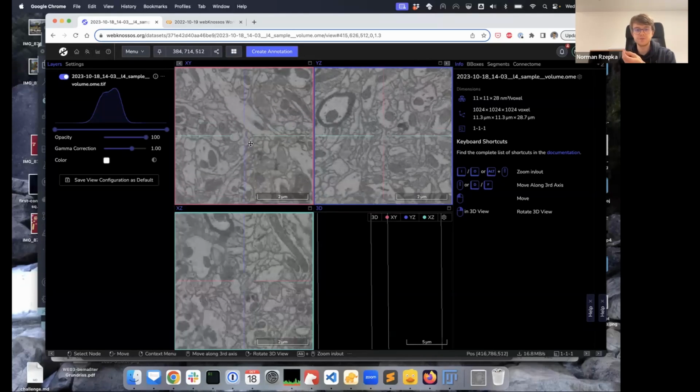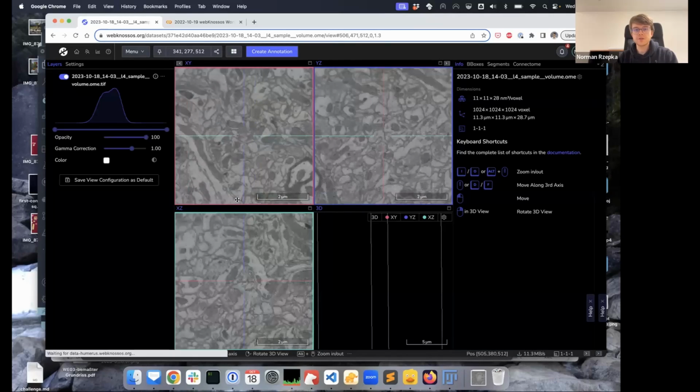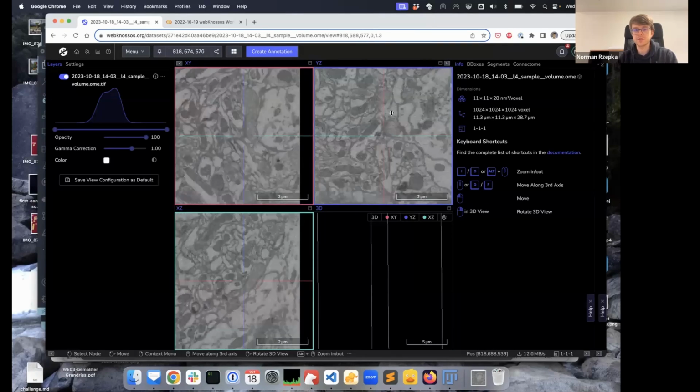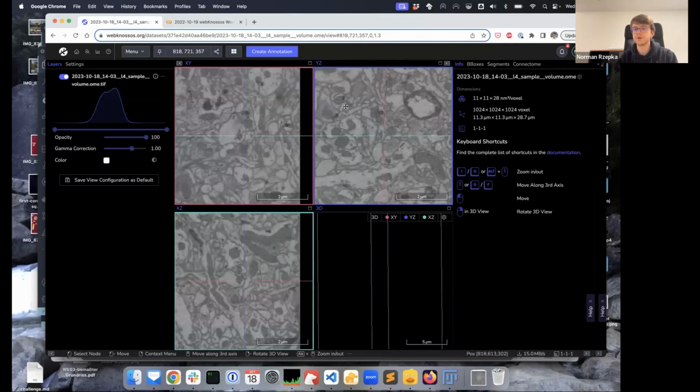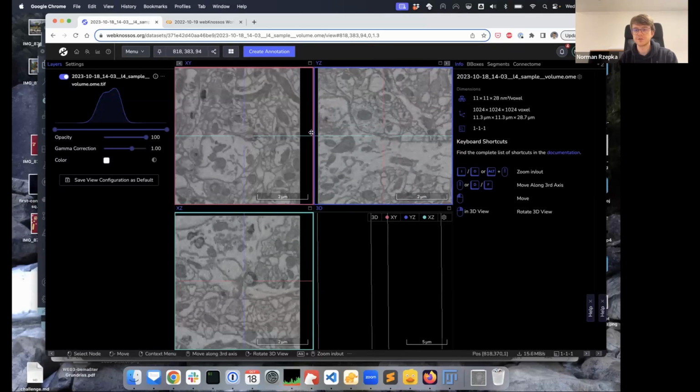You can browse around, of course. You can use a visualization tool with your mouse, just dragging around. That works in all 3 dimensions, and the data will be loaded. Basically, if you move around, then the data will be loaded in just to fill up your screen.